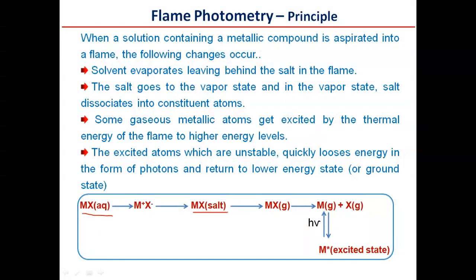Then the salt goes to vapor state, or I can say gaseous state, and in the vapor state the salt dissociates into its constituent atoms.